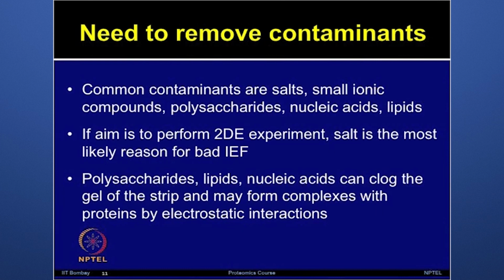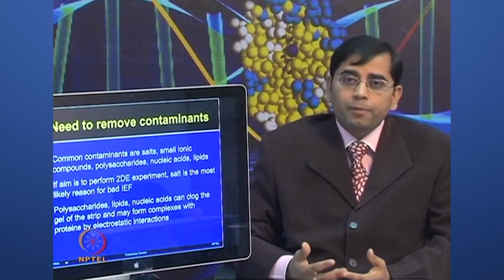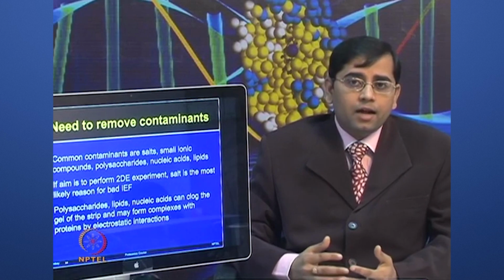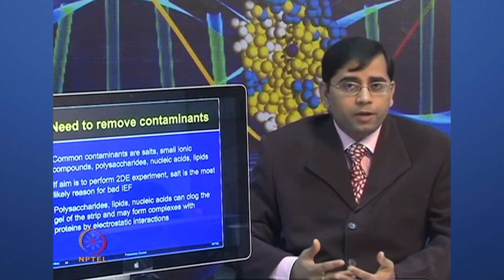These components can form complexes along with the proteins by electrostatic interactions, and when you are separating the proteins by using gels, they can clog the gel. So, in gel based proteomic methods, these artifacts are going to affect the quality of the experiments very much.